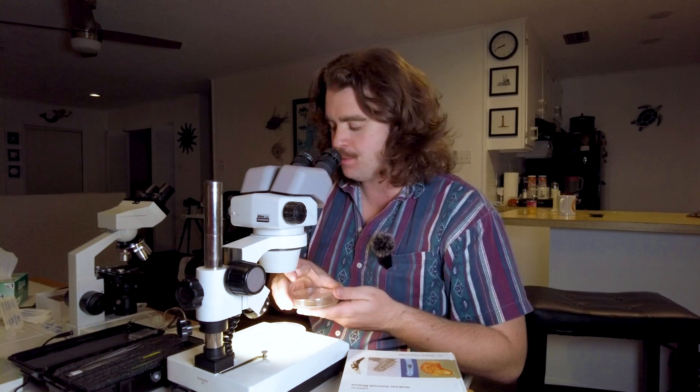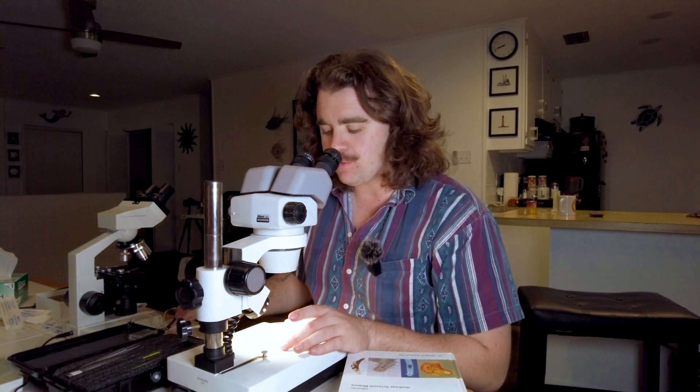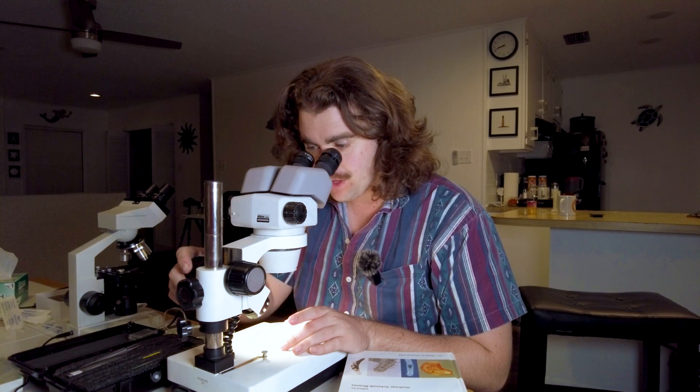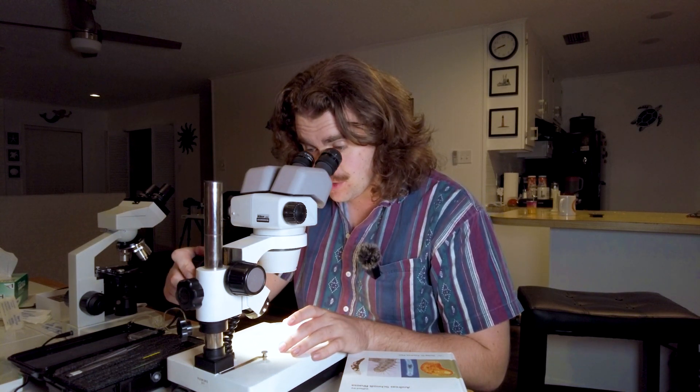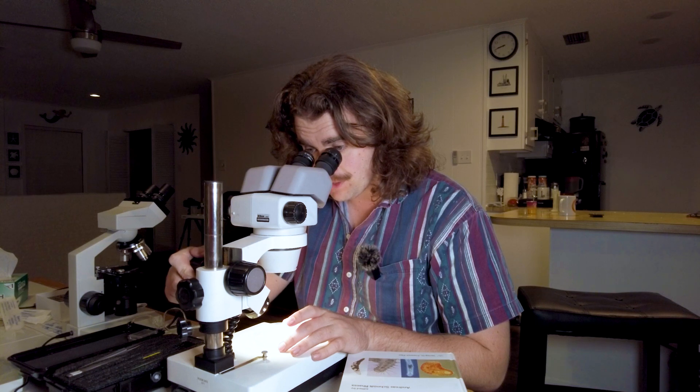Now that we've done our extraction, we're back at the microscope. You should bubble and blot a couple of times so you have a few petri dishes. We're going to be looking for Kinorhyncha in our sample. One of the key things is that you want to look at the bottom of the dish because there's going to be a lot of detritus they could be crawling around in, but also look at the surface layer.